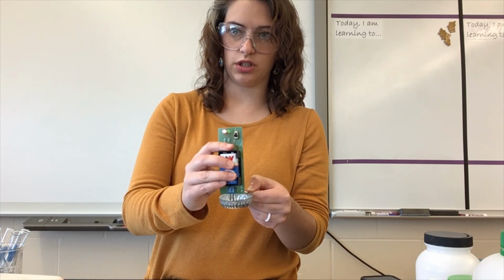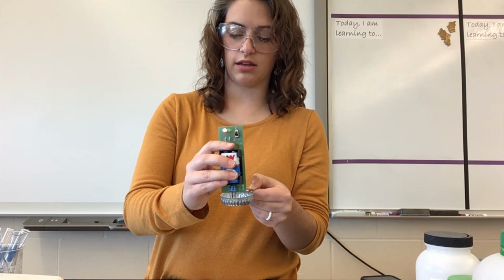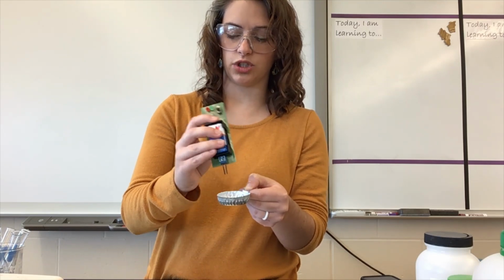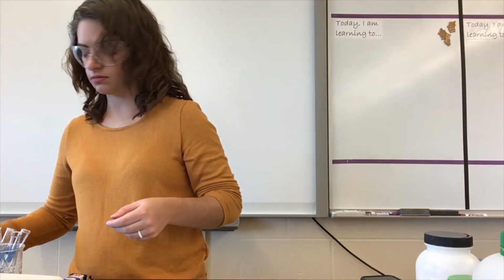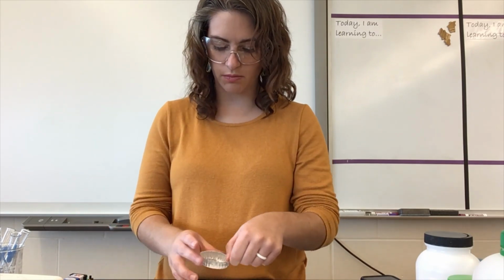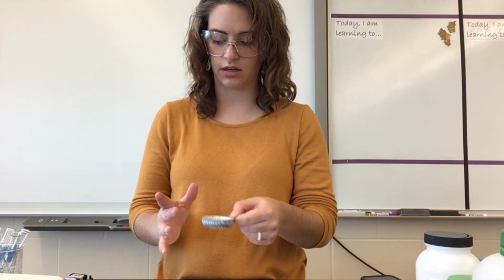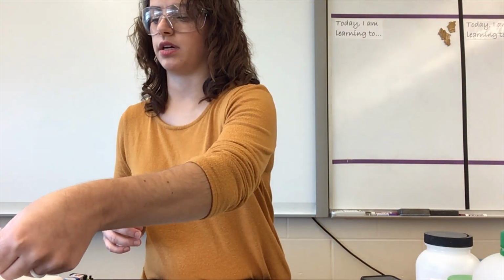Definitely conductive in solution. So not conductive as a solid, yes, conductive in solution. Okay, and then we're going to do melting point. So I'm going to use the last little bit that's in my weigh boat, pop it on my hot plate.